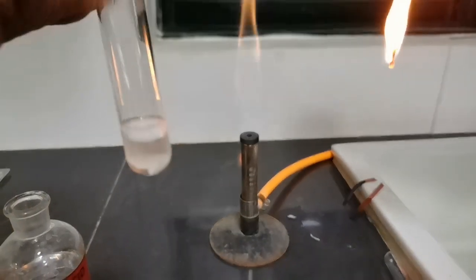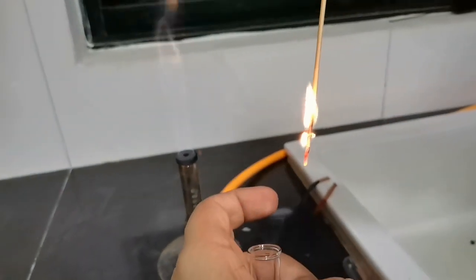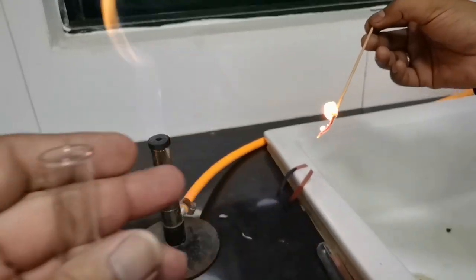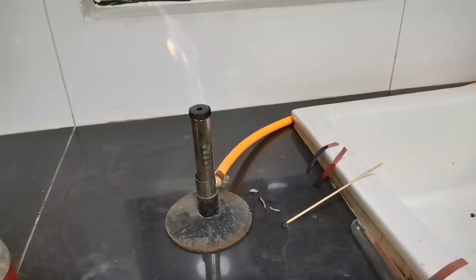The magnesium ribbon is still reacting with the sulfuric acid. Now for the pop sound — as you heard, there was a slight pop sound when the hydrogen gas was released from the tube and the burning splinter was exposed to it.